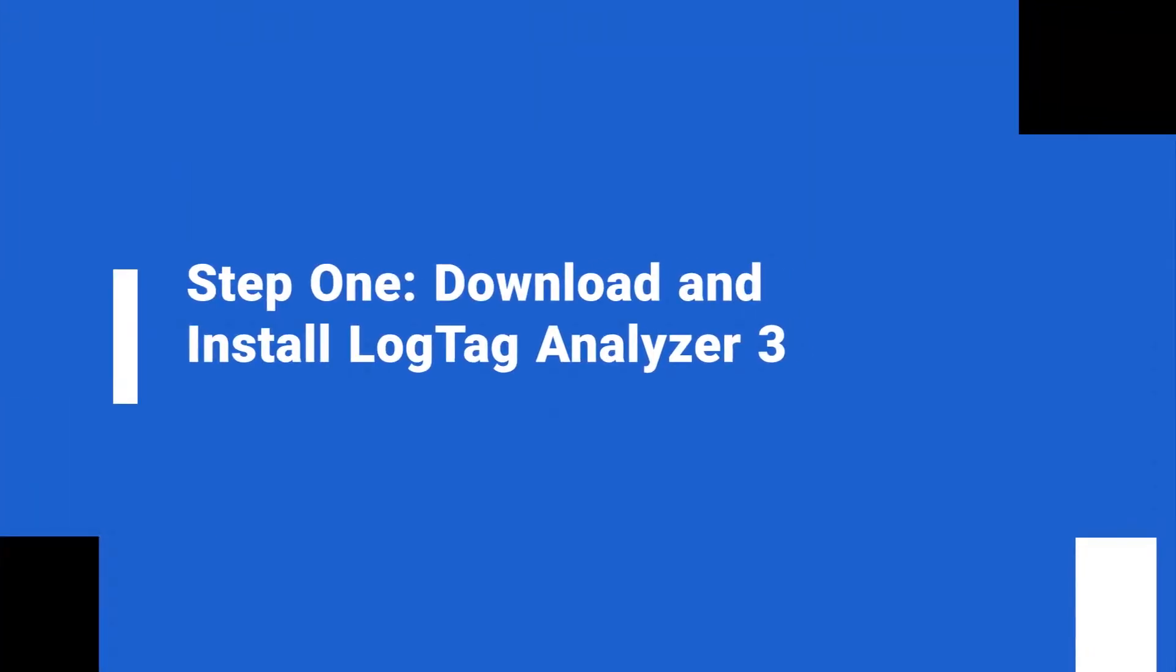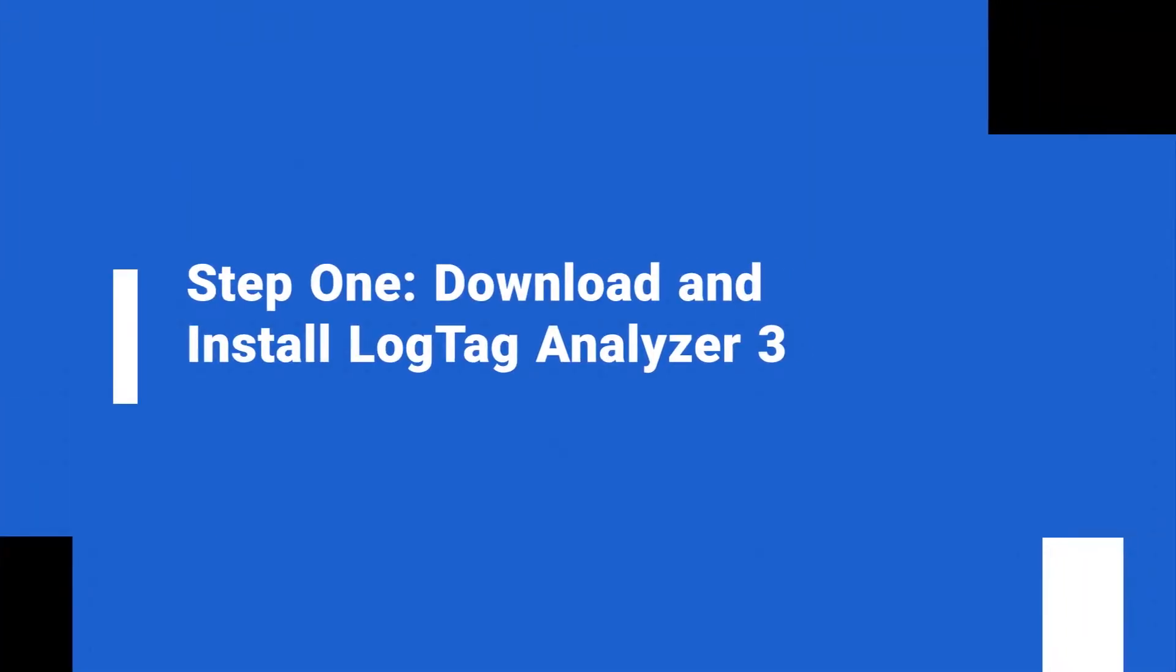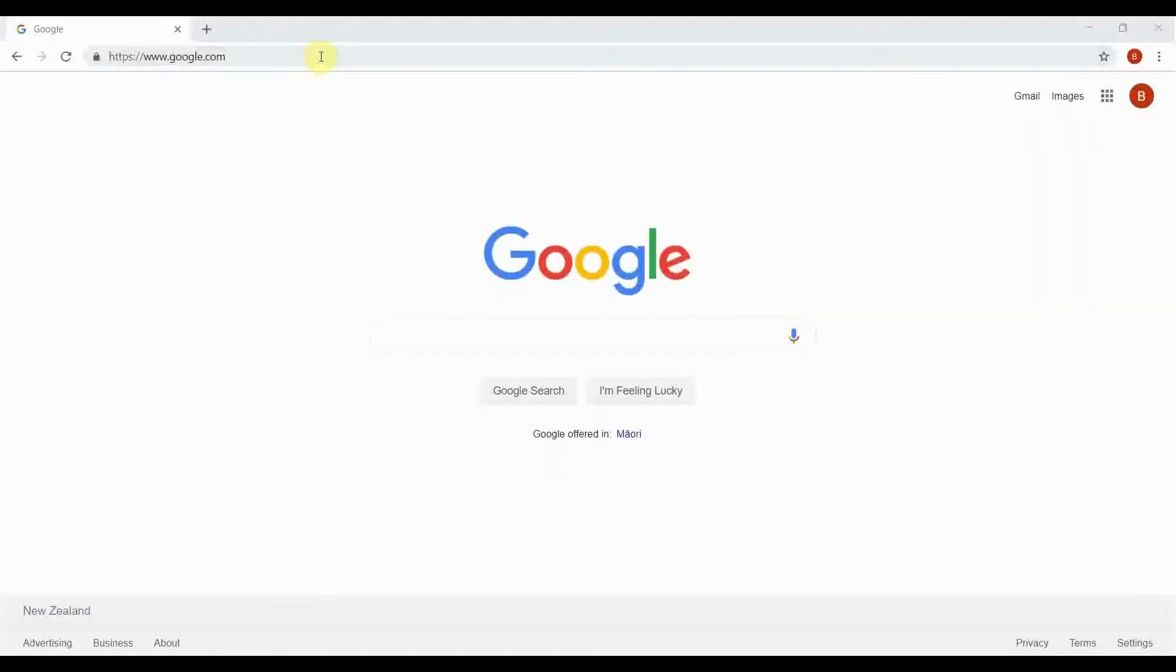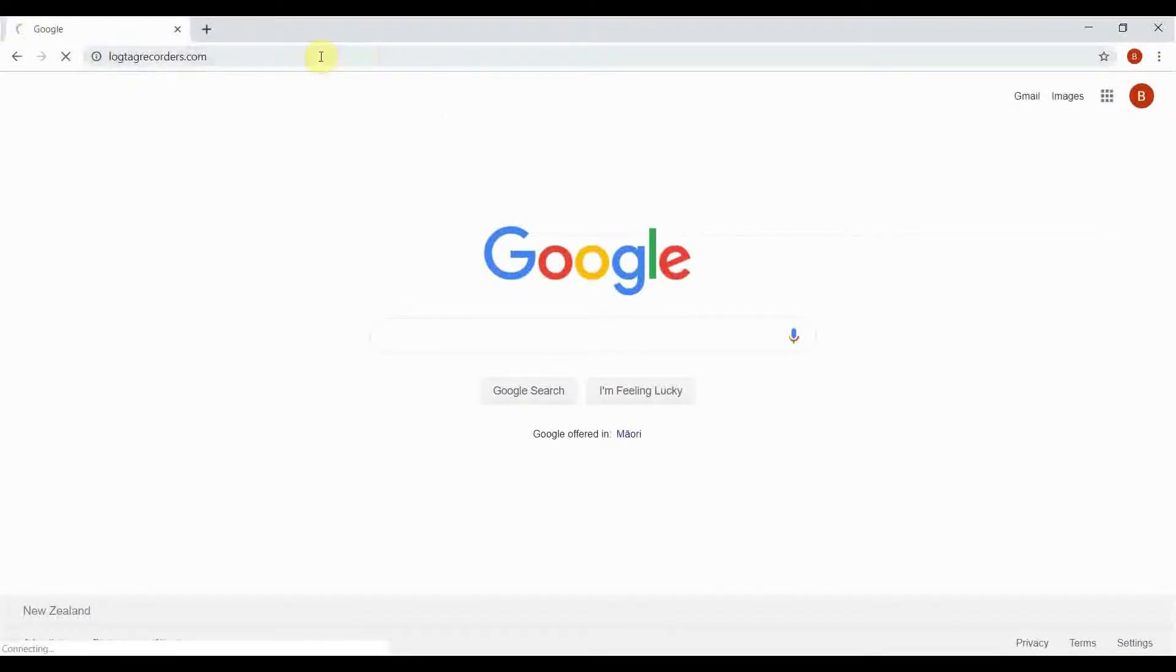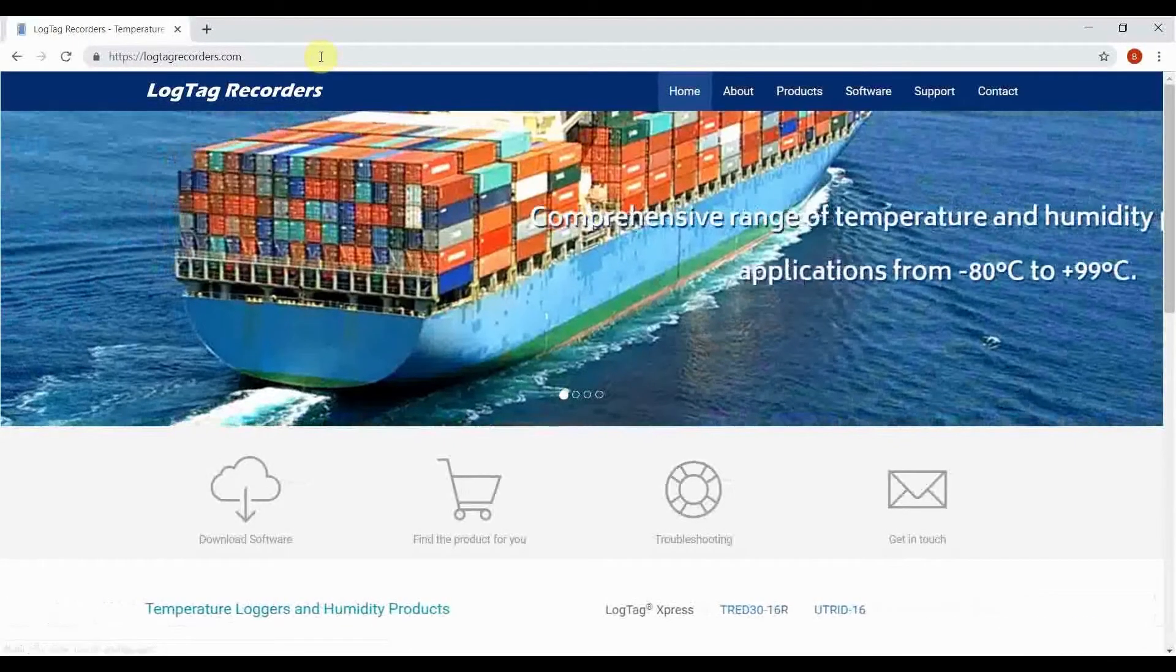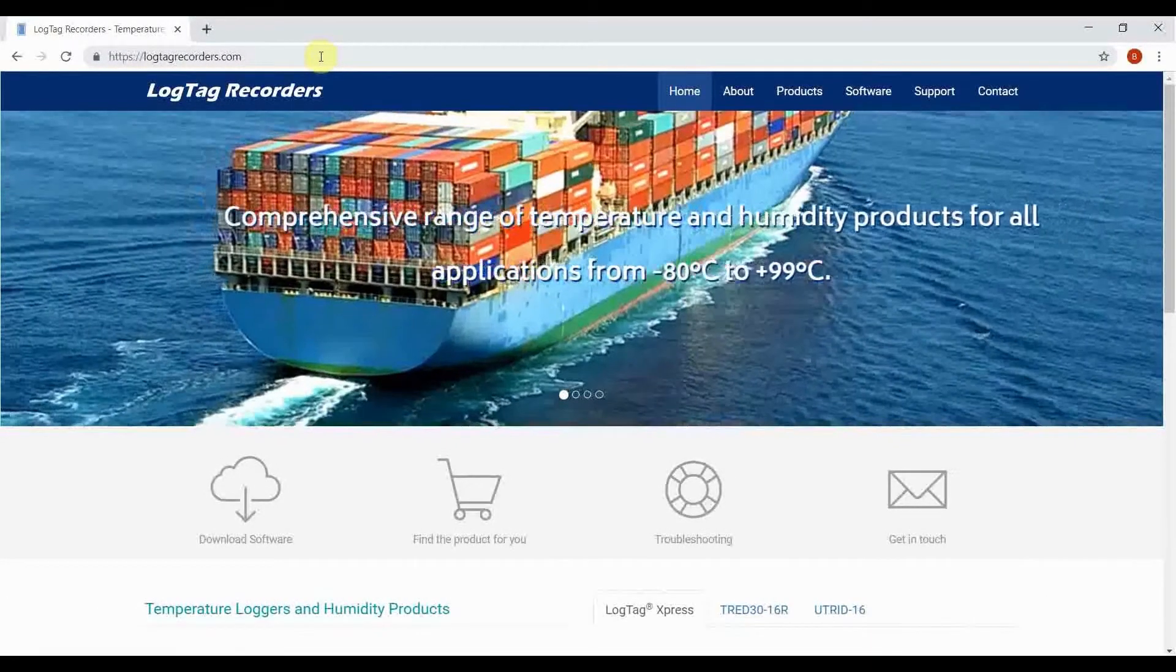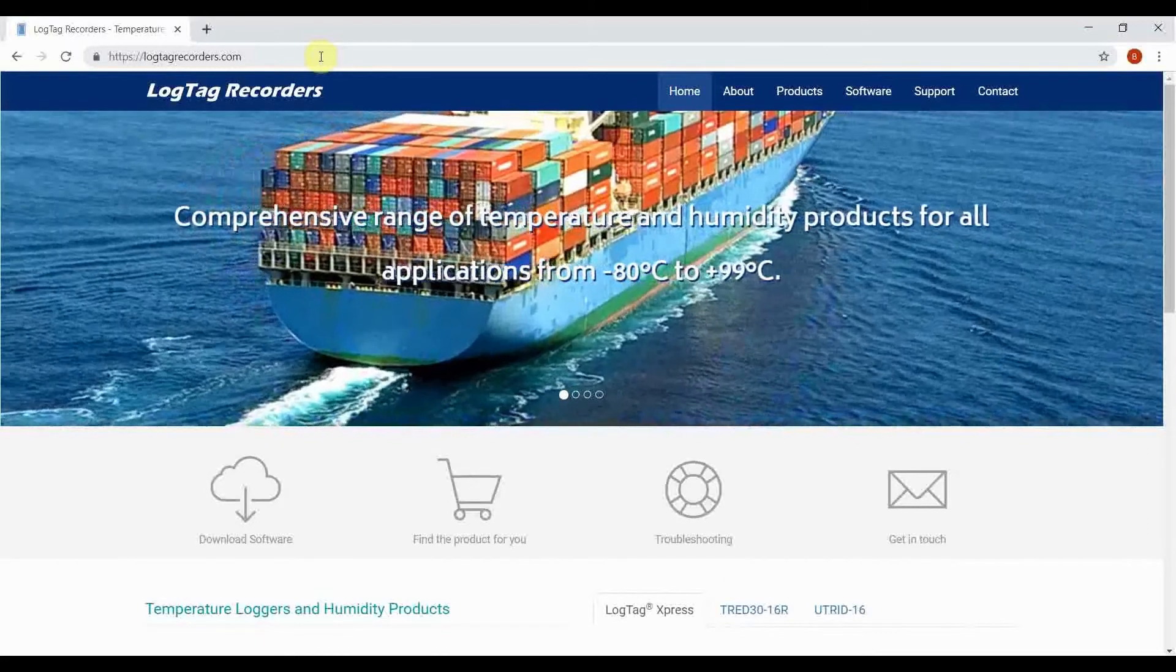To configure your device, download the latest version of our free LogTag Analyzer software. Click on the link in the video description below or browse to our website at logtagrecorders.com.